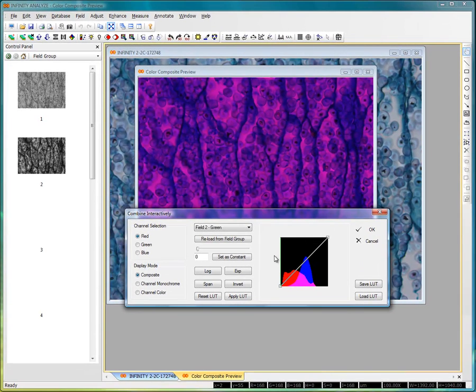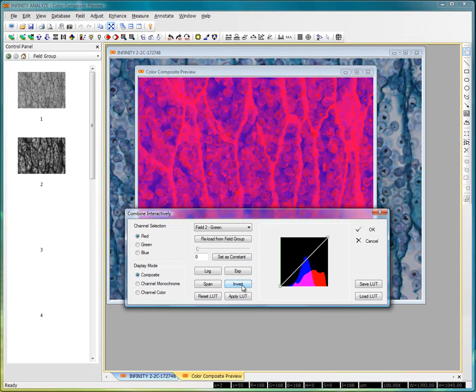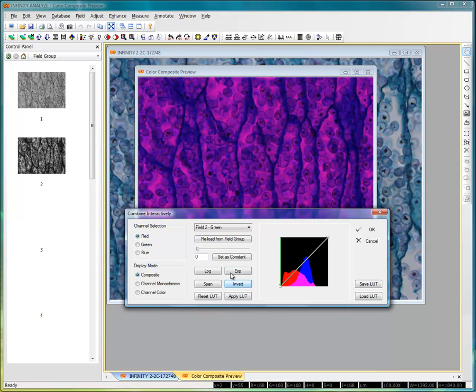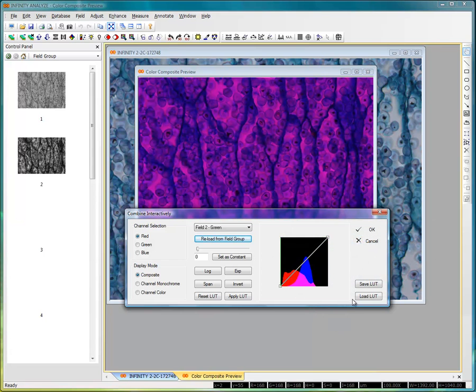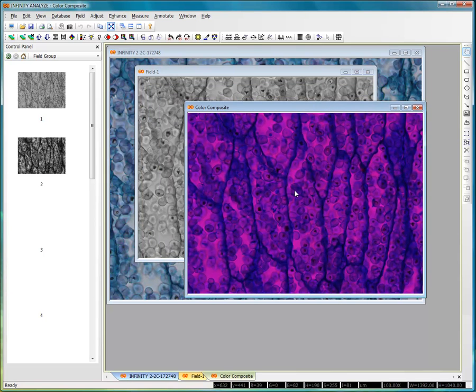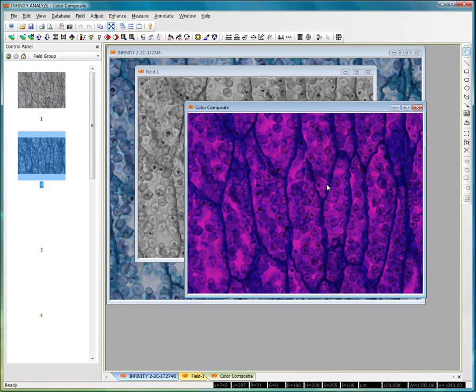So combining any two images — whether you used fluorescence, different dyes, or different filters — you can combine monochrome images in this way using any of the tools available. You can invert a particular channel, for example just inverting the red channel, or do an exponential histogram stretch. You can reload from the field group to get back to normal. You can also save a custom lookup table and reload it when you go to do another color composition and apply it to your image. I'm clicking OK, and it's created the color composite resulting from these monochrome images. You can see the striking results that you can get from using the color composition tool.